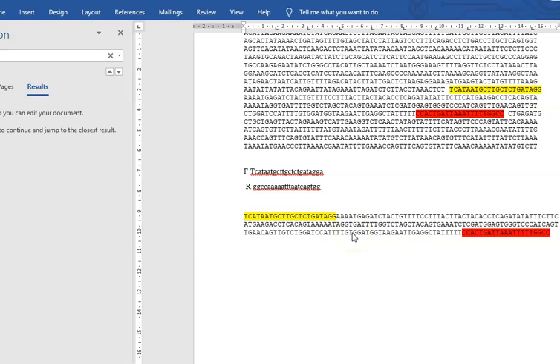Now this is all very well, but this is the DNA sequence. Now the DNA sequence might be introns, it could be exons, and we don't actually know that for sure. So this is the end of part 1. In part 2, what I'm going to do is take you through where we can verify that this is indeed the DNA sequence that represents the bit of the coding region that includes codon 600.